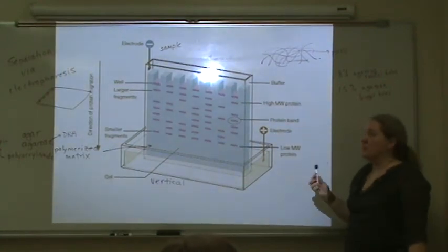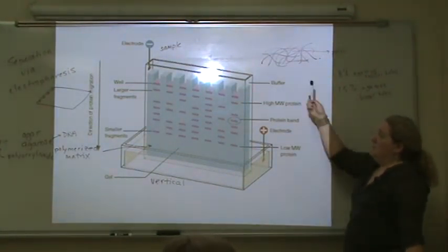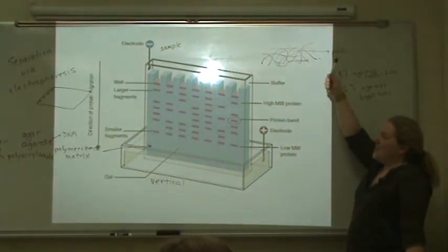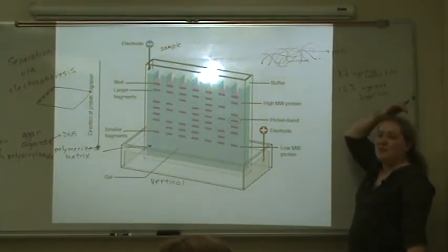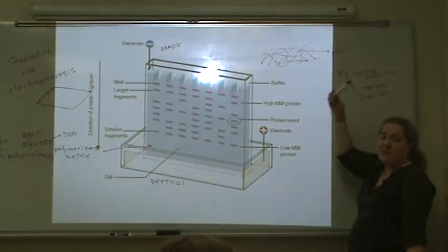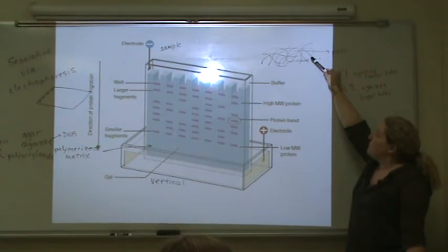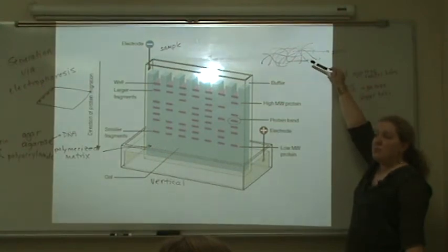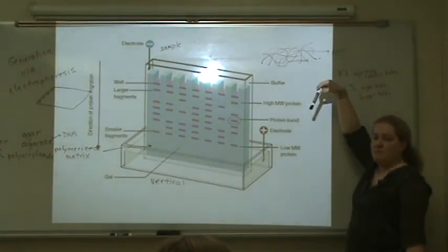I don't know why I said lumber. One of you's got a twig, and one of you's got a lumber carrying it around. Who's going to make it faster through that forest? The twig person, because they've got a little short stretch to weave through the forest. The lumber person will have to turn the lumber to make it through the gaps.